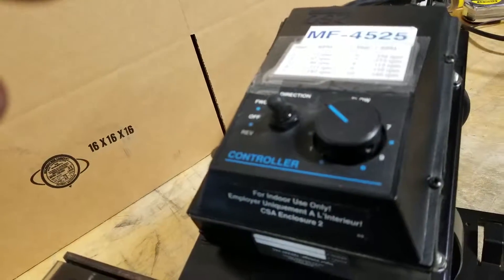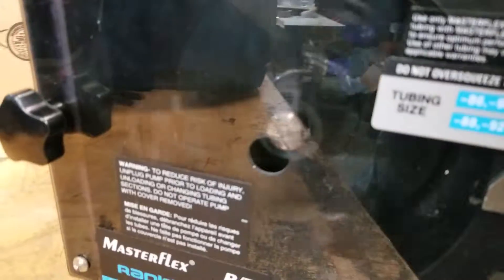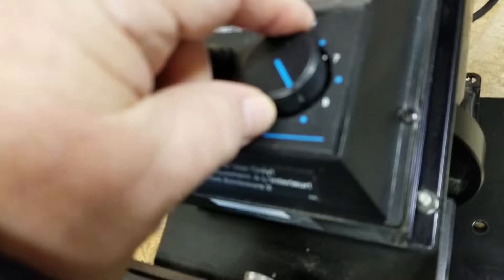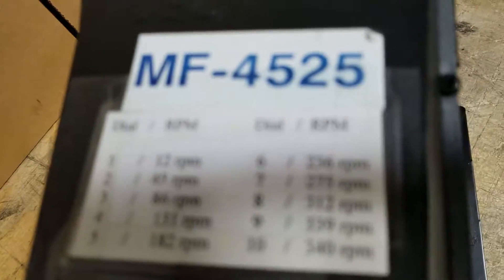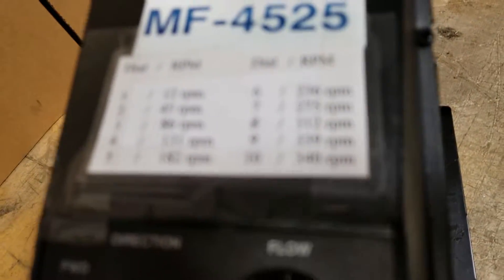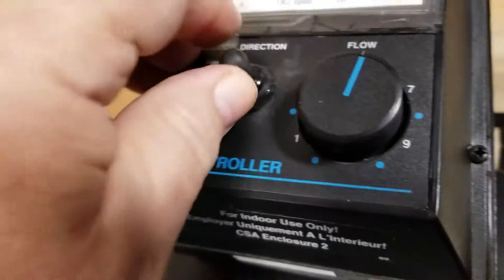Here's reverse. We have a speed control. It's an MF 4525 — that must be the number of the controller. This is telling you what the flow is.